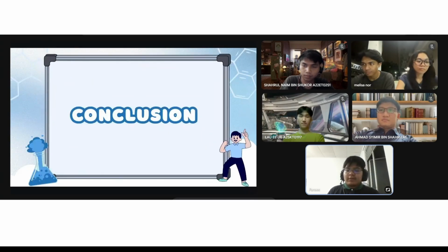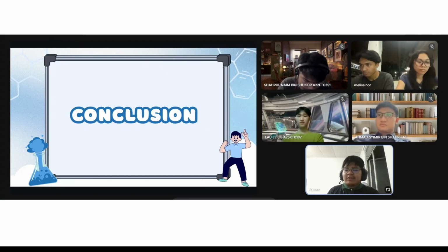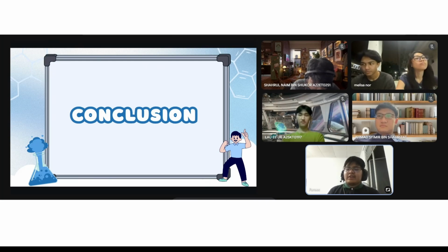In conclusion, monitoring glucose levels is essential for controlling the fermentation of oil palm EFB into bioethanol. Classical methods such as Benedict's test provide a simple and low-cost way to estimate glucose concentration. Meanwhile, instrumental methods such as HPLC offer rapid and highly accurate measurements required in industrial applications. Both techniques play important roles depending on the required accuracy, cost, and operational needs. Analytical chemistry continues to support the development of sustainable biofuel production in Malaysia.